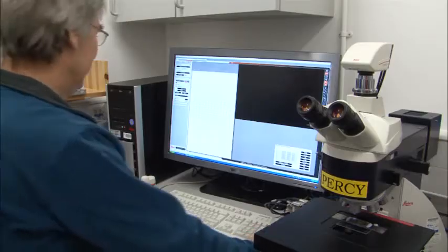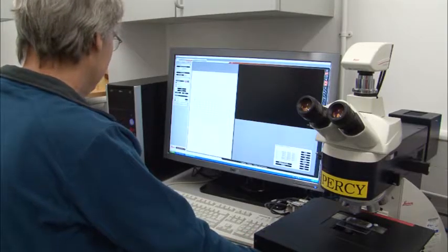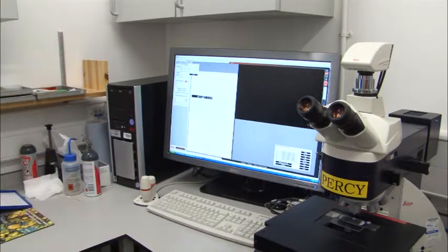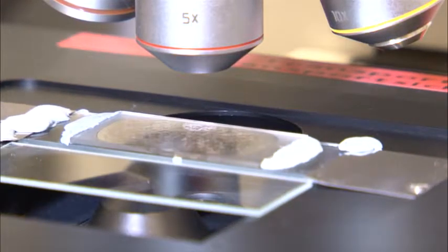That's the standard size for geological thin sections, and at that thickness you can see through the mineral grains when you use a microscope. We've got two different digitizing processes to turn this information into a website form.